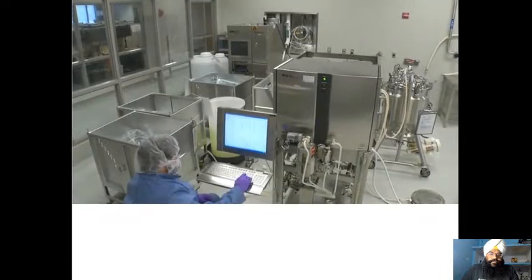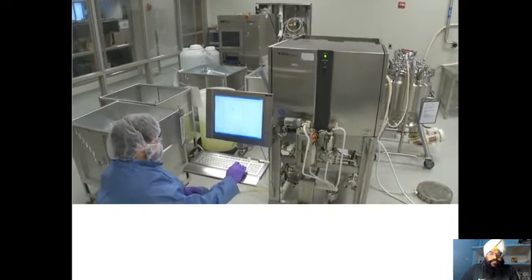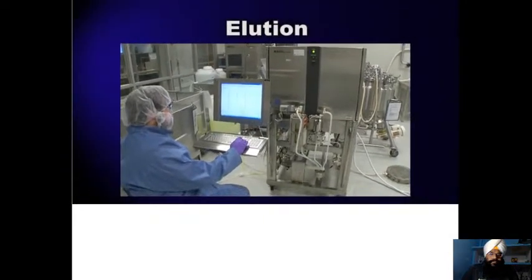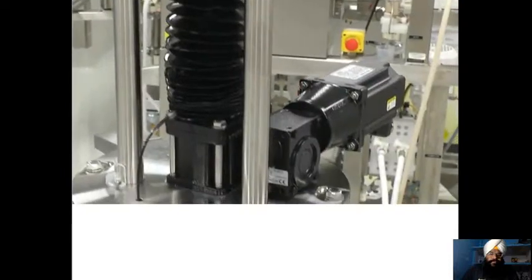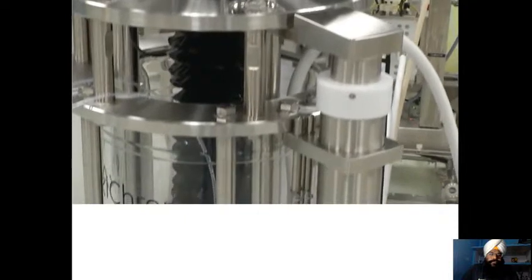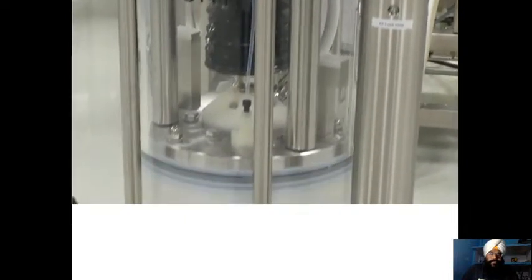When all the lysate has entered the column, or when the capacity of the beads to bind the protein has been reached, it's time for elution. Elution is the release of, in this case, green fluorescent protein from the beads by using a new solution, in this case a buffer that includes NaCl, sodium chloride solution.